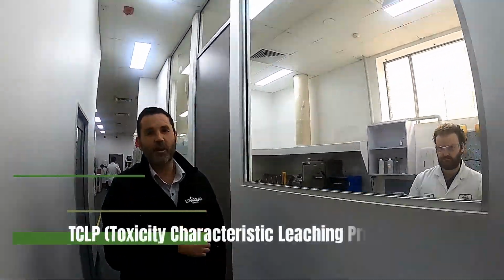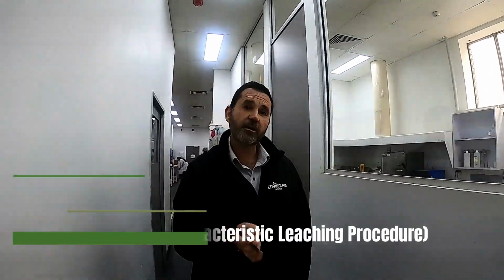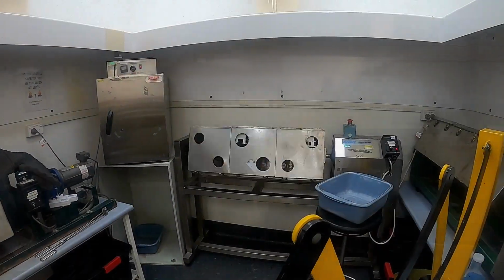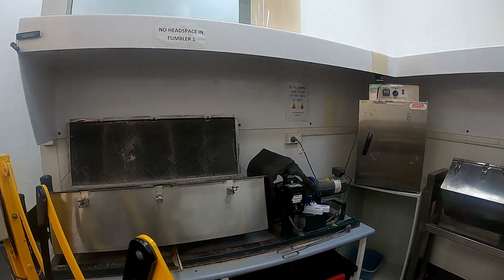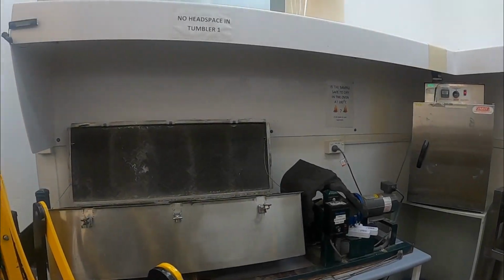This is our TCLP room. In here, we're tumbling soil for 18 hours to simulate what contaminants will be leached out in a landfill. So this is our TCLP tumbling room, where soil samples are tumbled in either a buffer or distilled water. And the most common tests here are PAHs or metals.